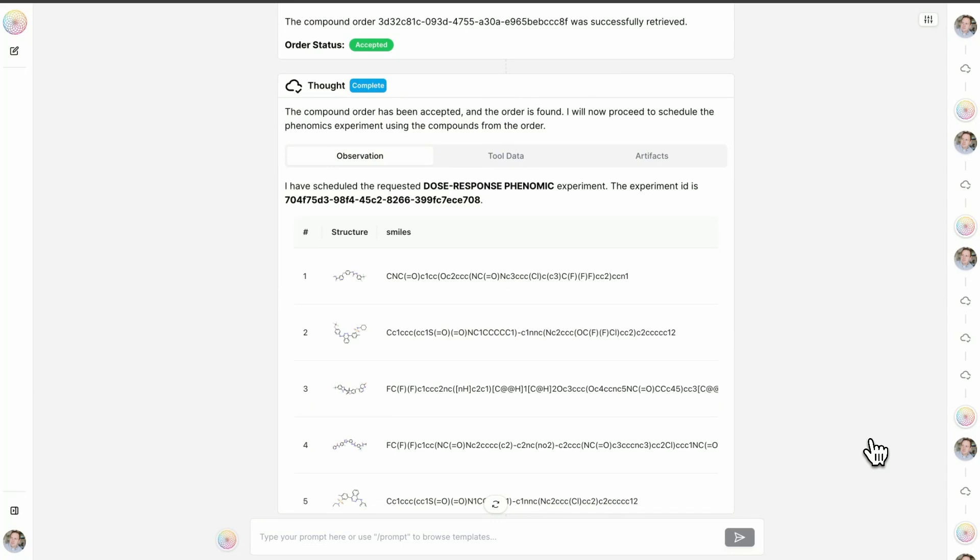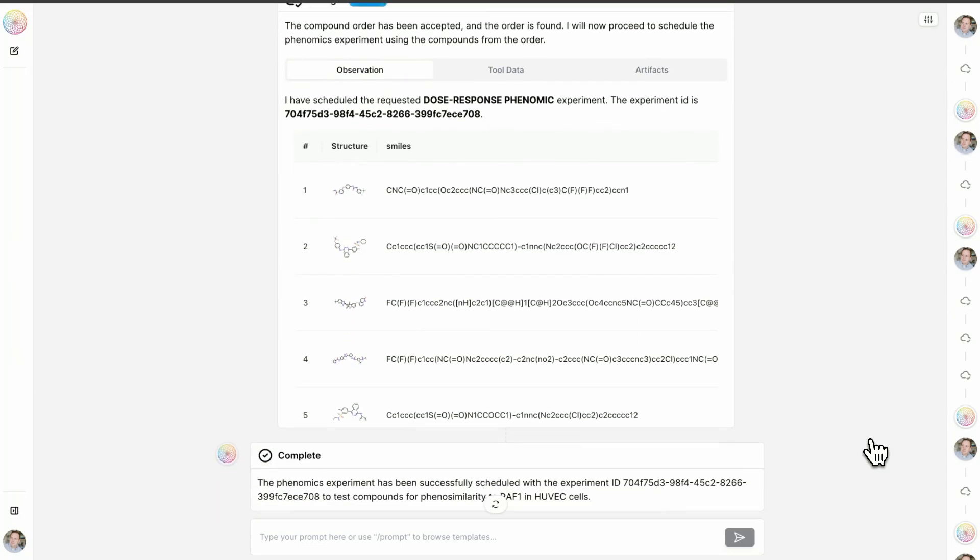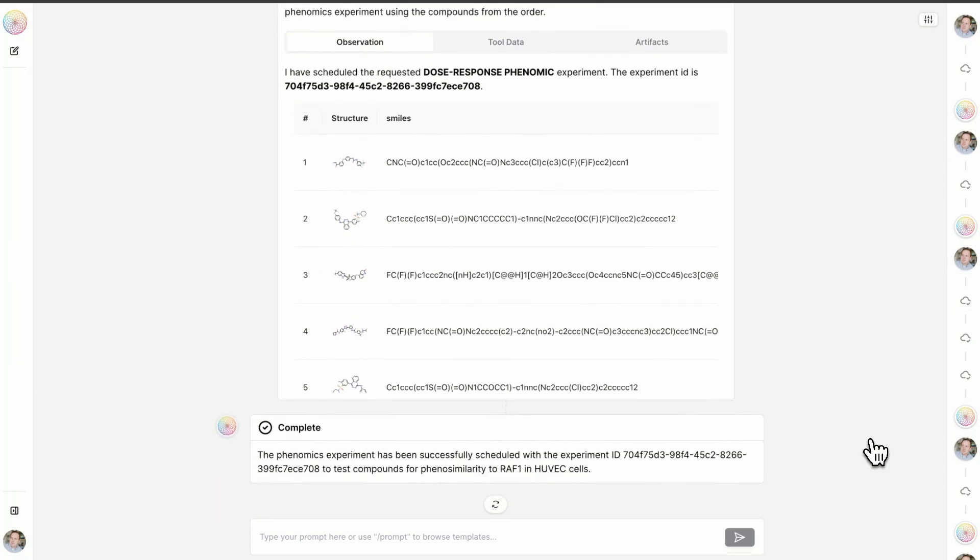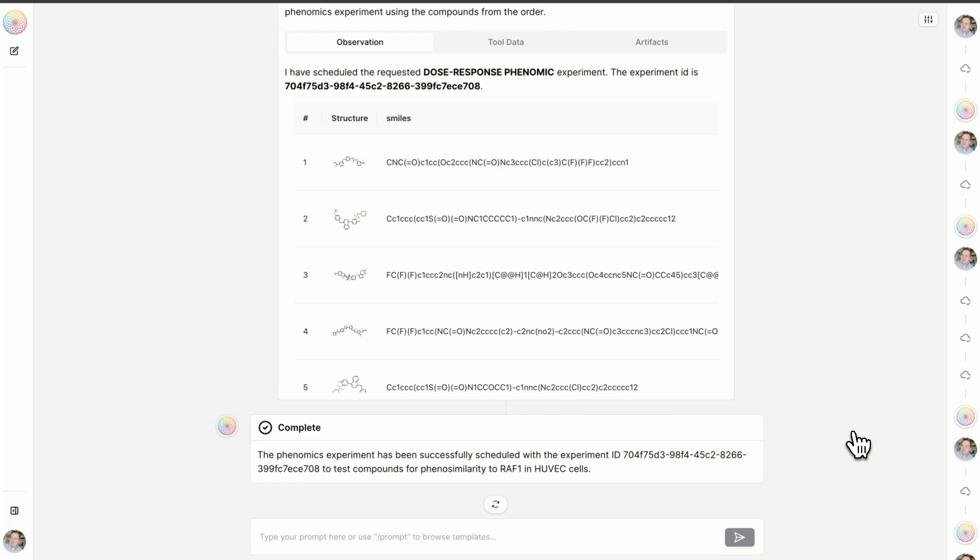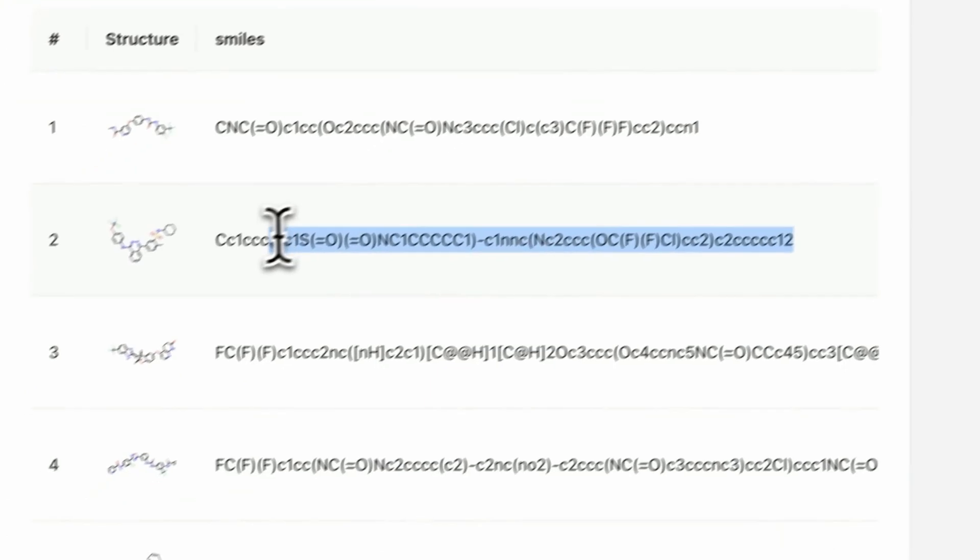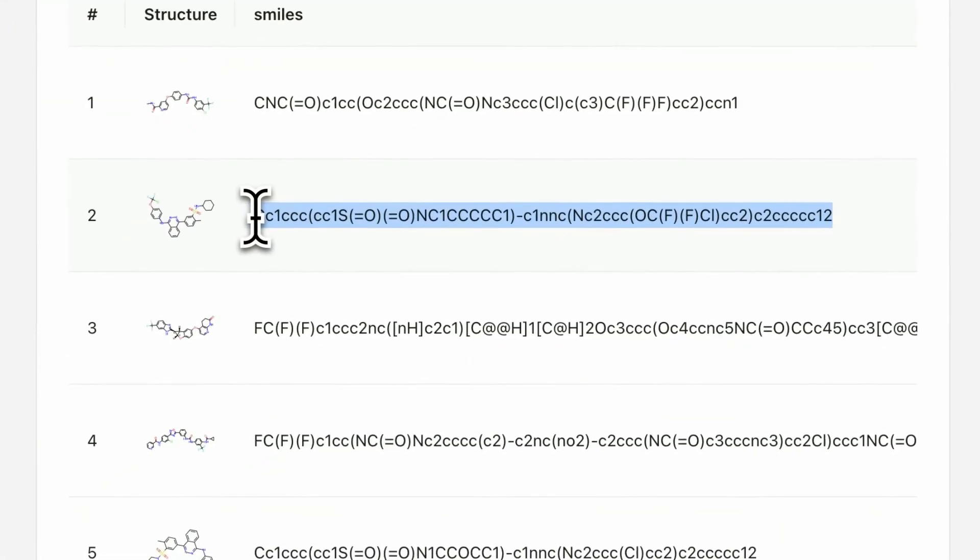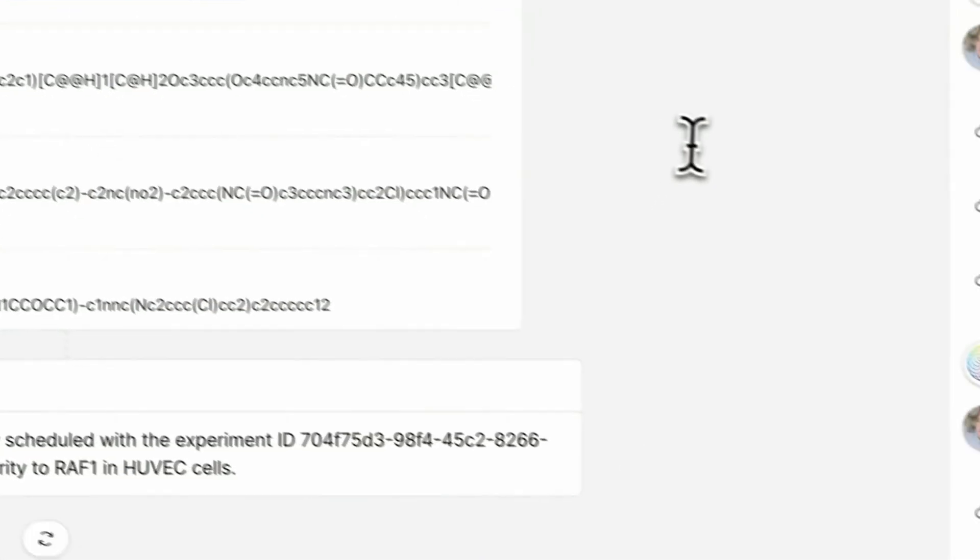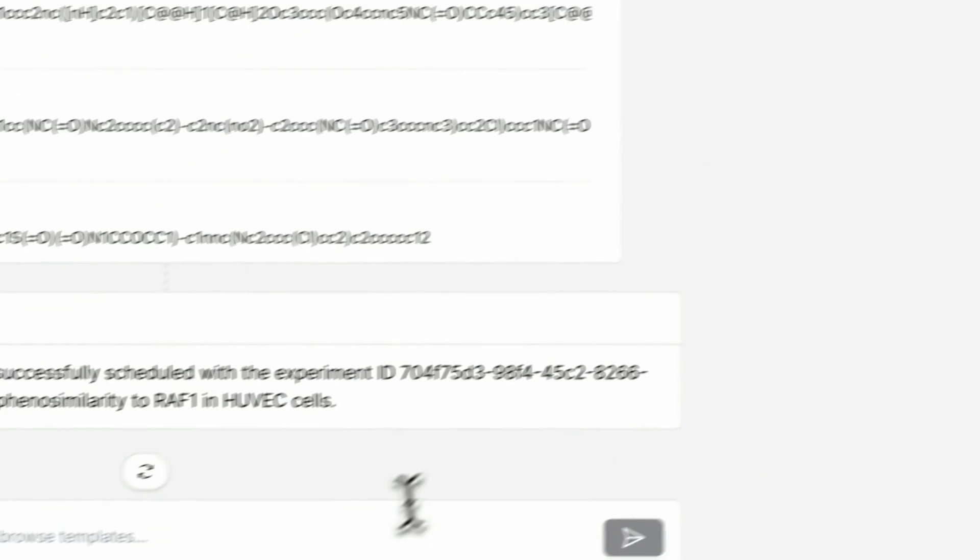So I want to fast forward in your mind now with this experiment scheduled and pretend like we've gotten the data back. And indeed, many of the predictions from the Matchmaker tool turn out to be right. Many of these molecules do mimic in a dose responsive manner the CRISPR based knockout of RAF1 in phenomics, suggesting that these molecules have a similar biological function to eliminating RAF1 expression or inhibiting RAF1. And so let's now imagine that this particular molecule, molecule number two—I'll copy the SMILES string.